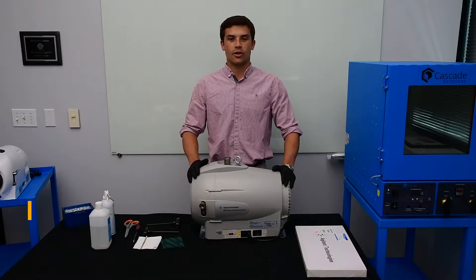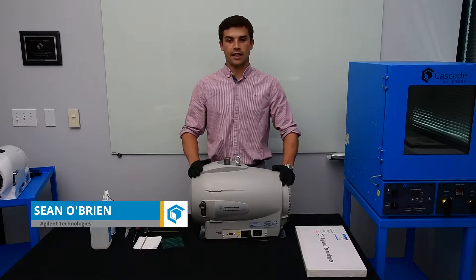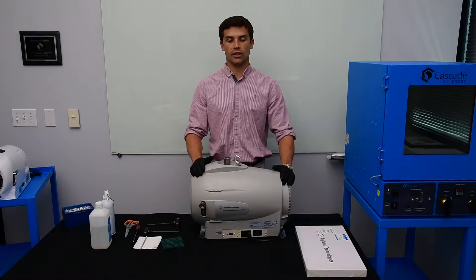Hi, my name is Sean O'Brien with Agilent Technologies and I'm here today at Cascade Sciences to show you how to do the maintenance and a tip seal change on an IDP15 dry scroll pump.